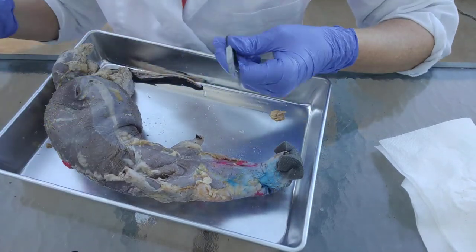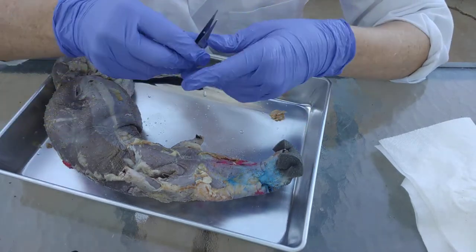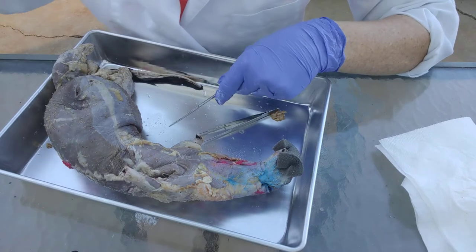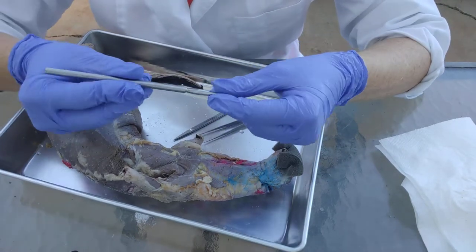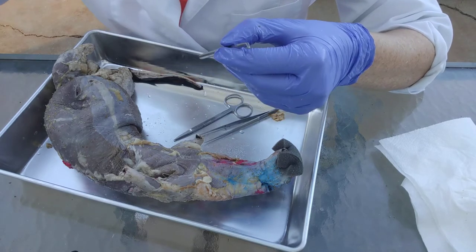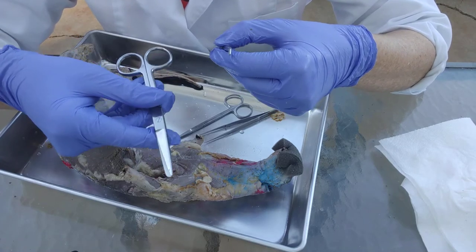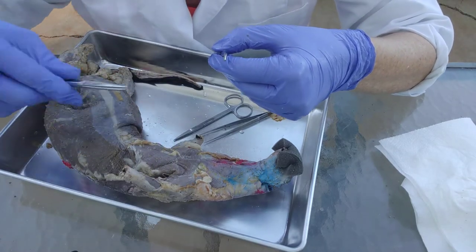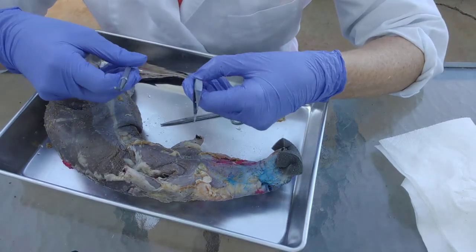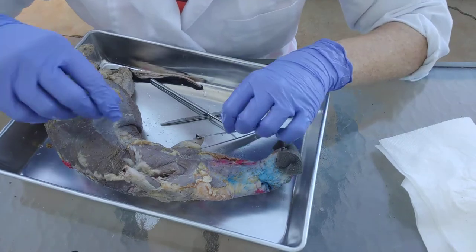The tools I like to use are the forceps — just tweezers — the fine scissors, and the blunt probe. You really shouldn't be cutting, so you probably will not be using your large scissors — the coarse scissors — until you're opening the ventral cavity. For the muscles, stick to just these tools, and don't forget your fingers are tools as well.